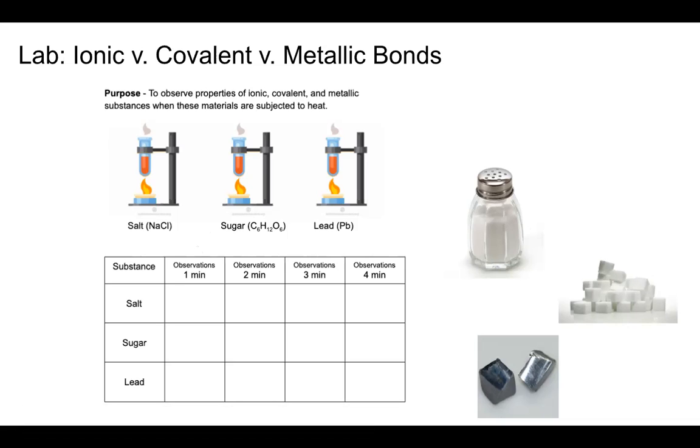You see the data table is just asking for observations of each of those 3 substances after cooking for 1 minute, after 2 minutes, and so forth, all the way up through 4 minutes. And I'm not looking for a ton of information or detail. We just kind of want to see, well, what happens? What happens to them? Tell us what you see taking place. For some of them, you might see very little happen at all. Some you might see a little bit happen. Some you might see a lot of change take place. All right. And so that's what we're going to try to record.